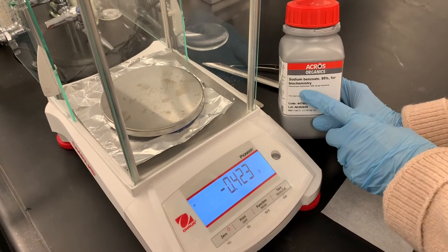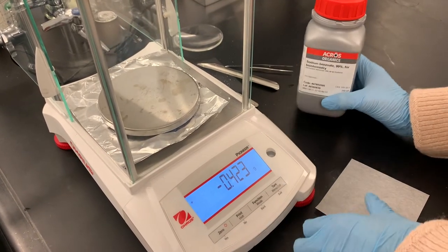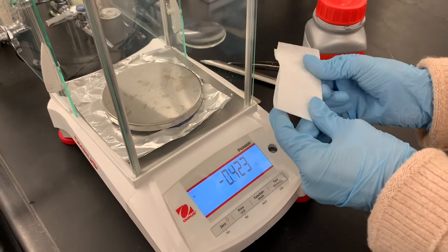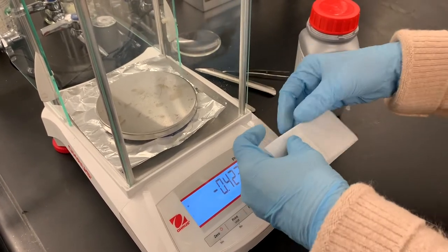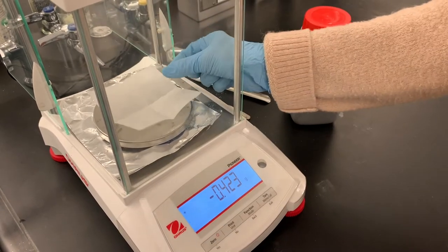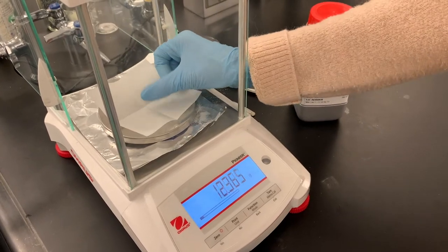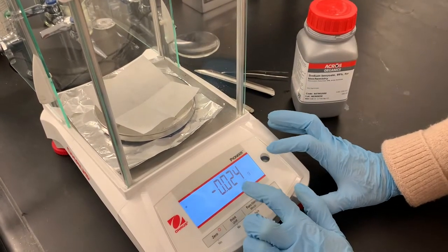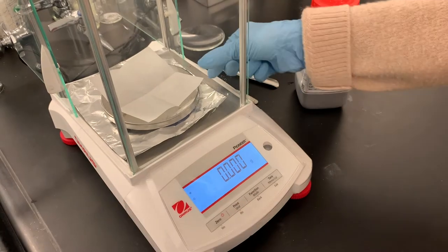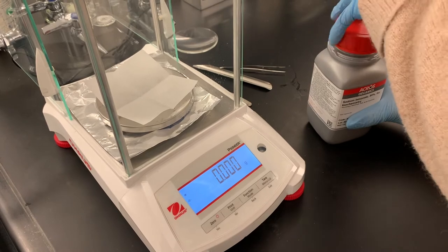We're starting out with about 2 grams of sodium benzoate — it doesn't have to be exactly 2 grams, just somewhere in that ballpark. The first thing we're going to do is take a little piece of weighing paper, fold it up to make it easier to pour the sodium benzoate into the beaker. I'm going to set that on the balance, tare it, and hit zero to reset so the paper's mass isn't factored in.